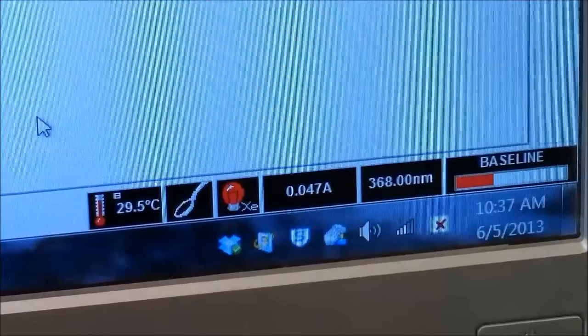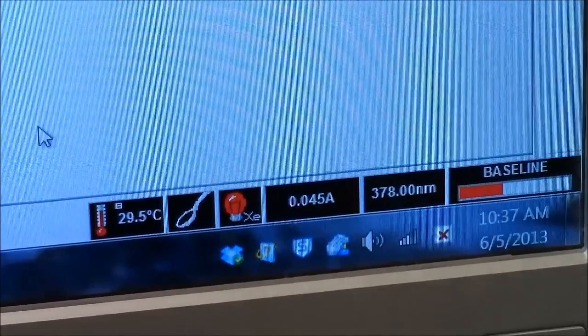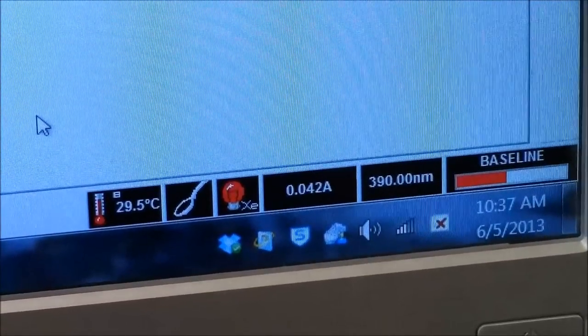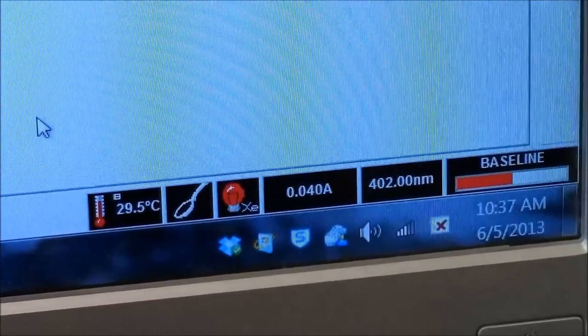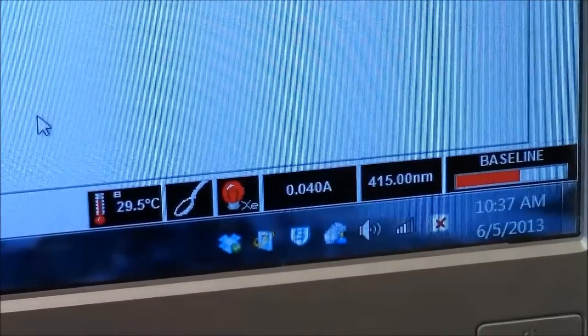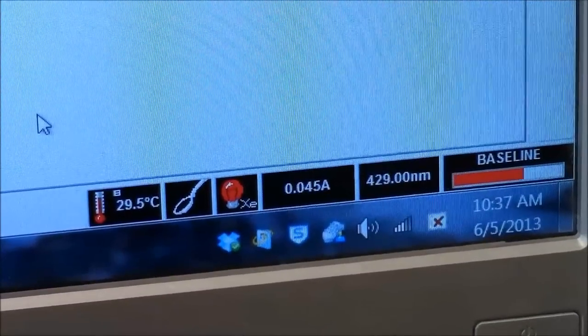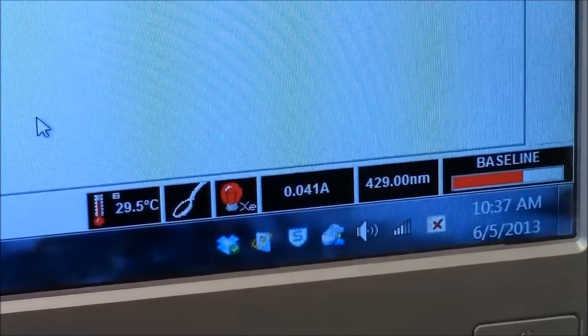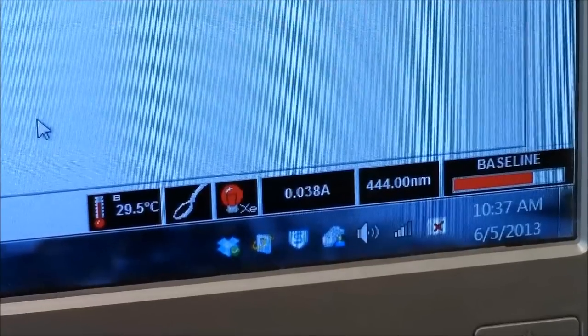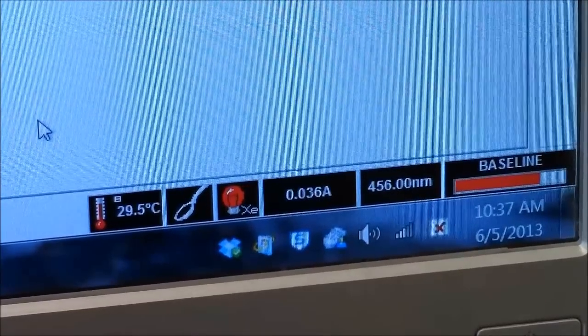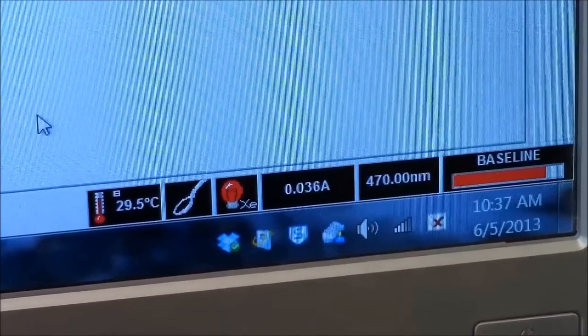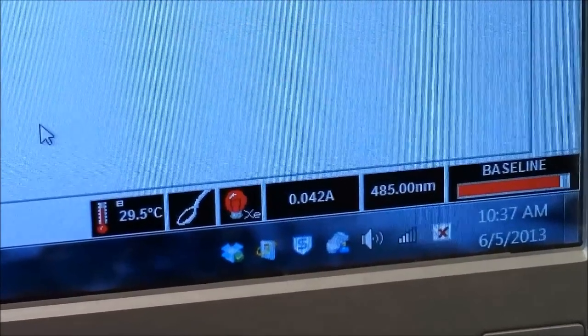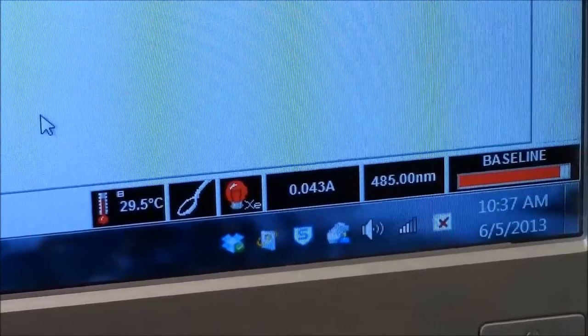So that when I put something into that cuvette, in addition to the ethanol, we'll be measuring the absorbance of the sample that I add. Not the ethanol itself, not the cuvette itself. So this makes all these zero.